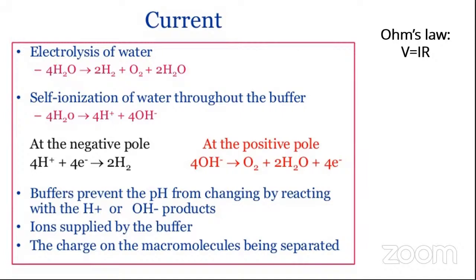Can I put it like this as well? Okay, Janki says decrease in resistance. That's a bit tricky. Okay. I can put it like this as well, looking at Ohm's law. Can I not say this? That voltage is directly proportional to resistance as well if I keep current constant. So if I increase voltage, can I not see an increase in resistance, if current is the same?